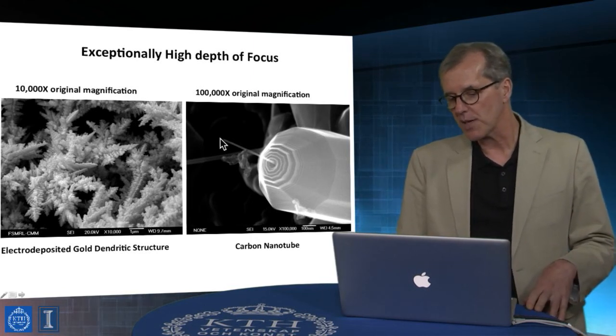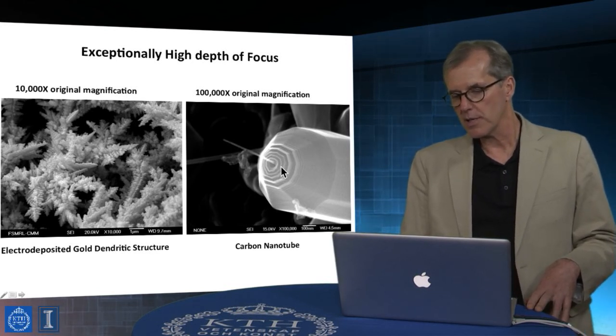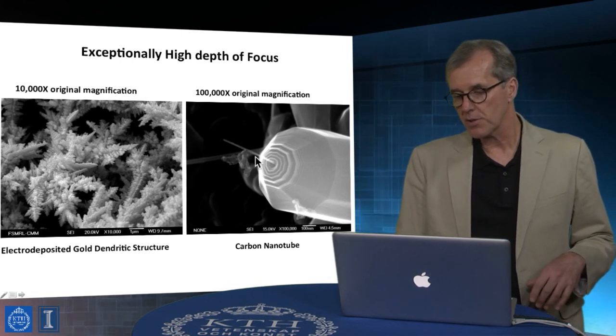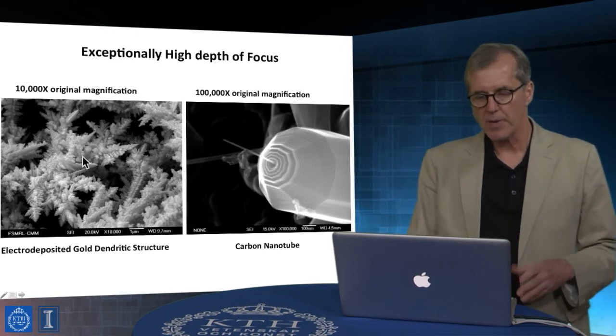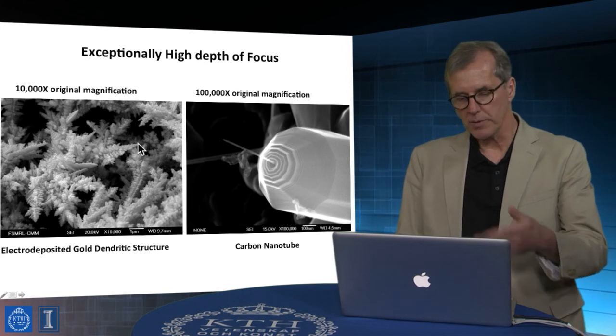But the thing that you could also say is that that's a very long tube, right? And so the depth of view, even if you look at what's holding this tube, everything in this image is in focus. All right, here's dendrites, and this is a deposition of gold.